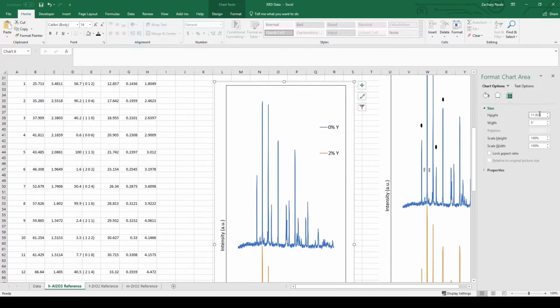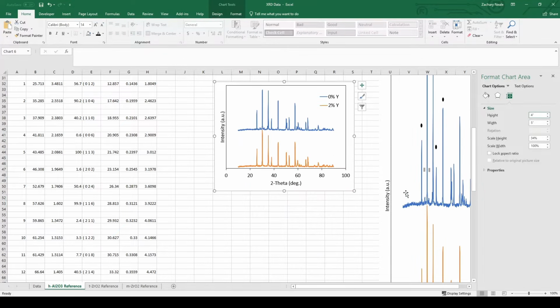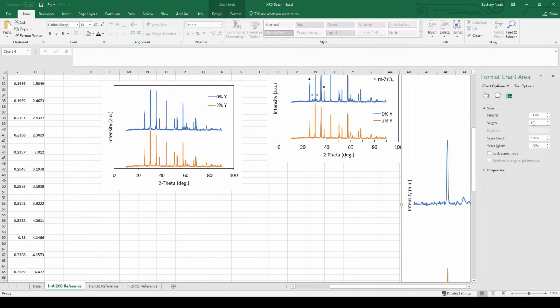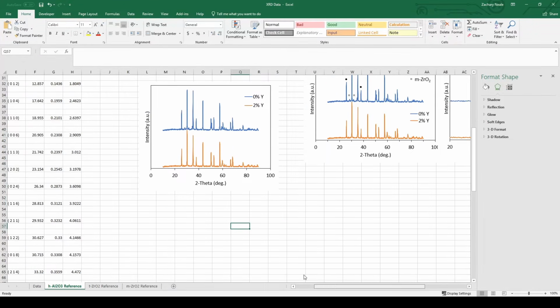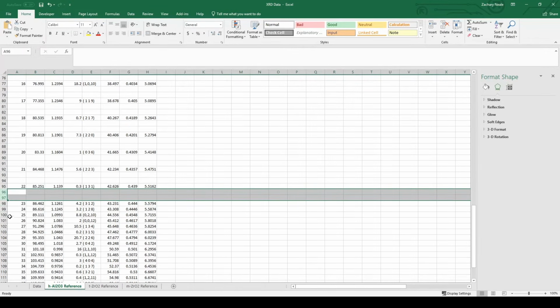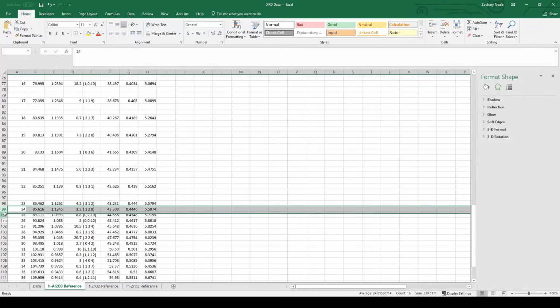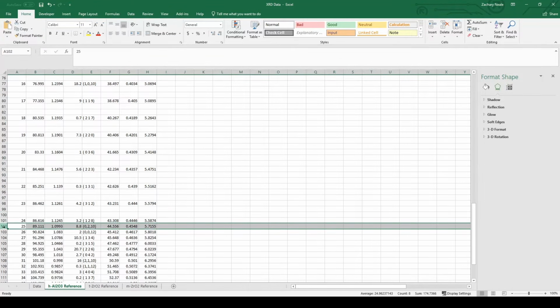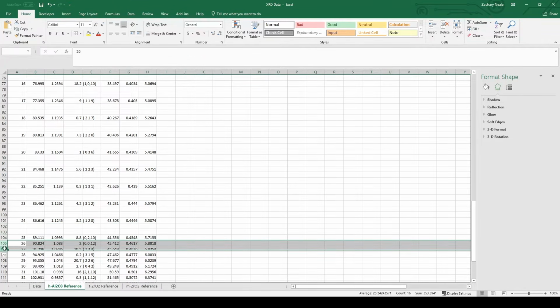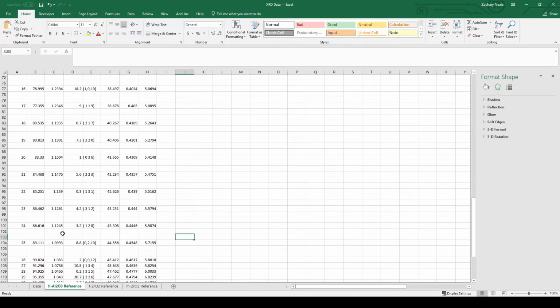You can just change this back. Okay, we just need to go up to 90 degrees.